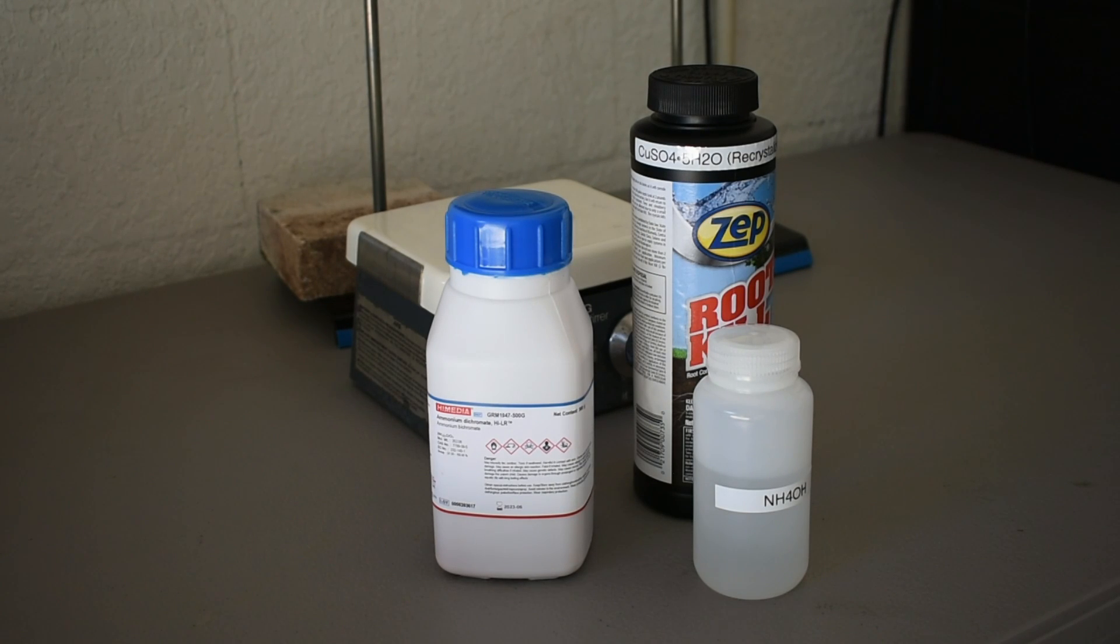Hello everybody, today we're going to make some copper chromite, which I'm going to use to decarboxylate niacin into pyridine, which I'm then going to use to make a nice copper complex. But to make the copper chromite catalyst, you're going to need three main chemicals.